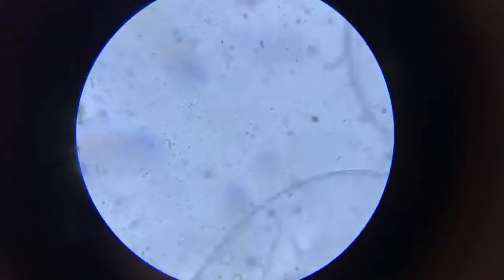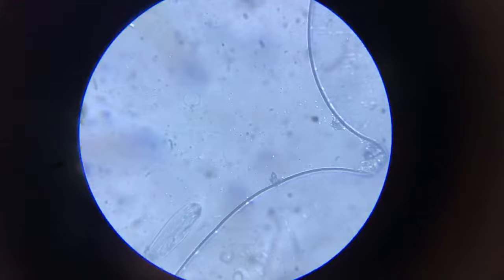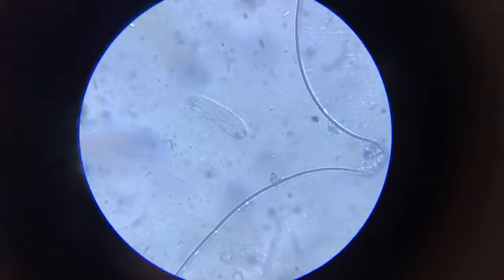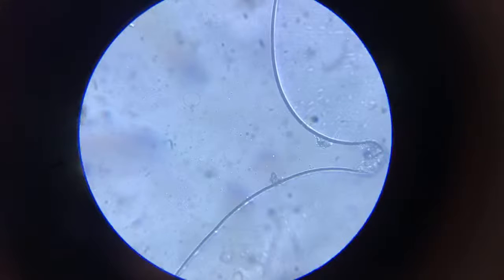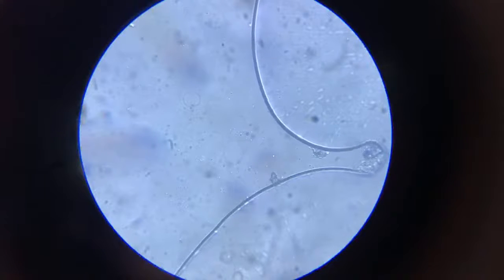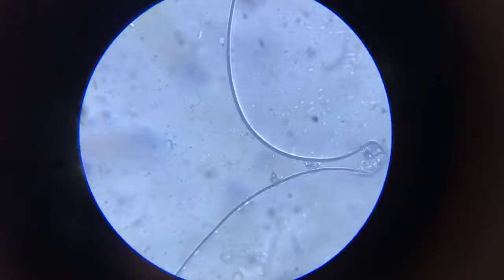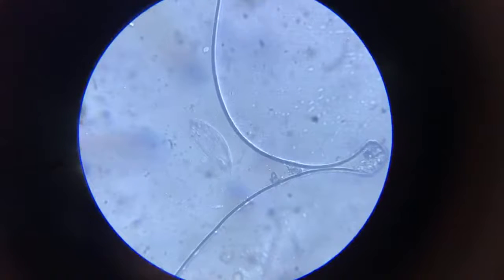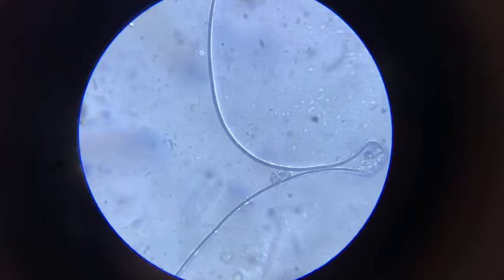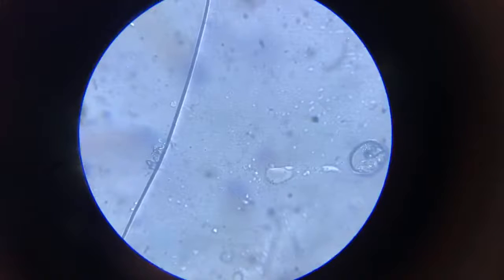There will be a small gradient of water availability, and those will be death traps. There you see the water slowly encloses a small fragment, and then once it is there, the two films just connect and break off, causing a small island of little bit of water like that, and still closing in.